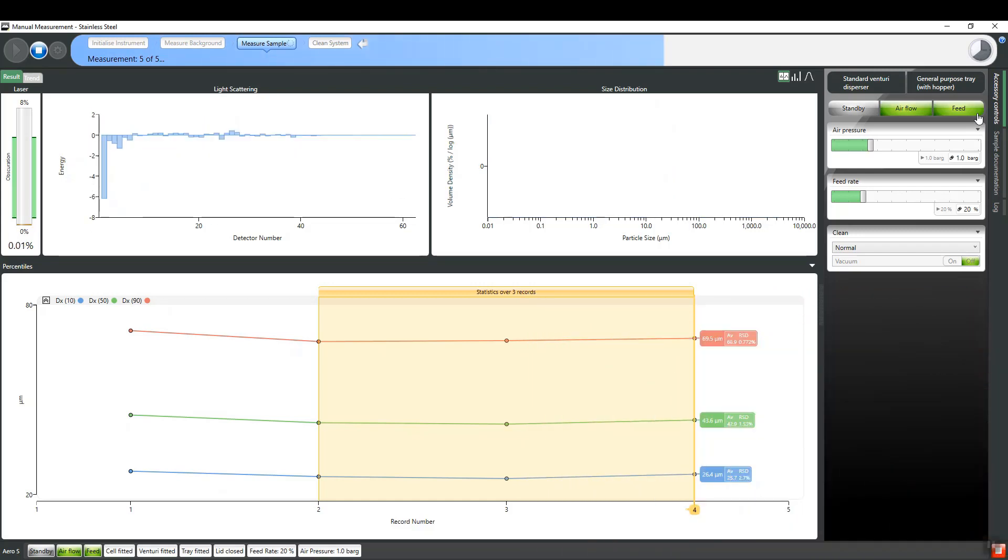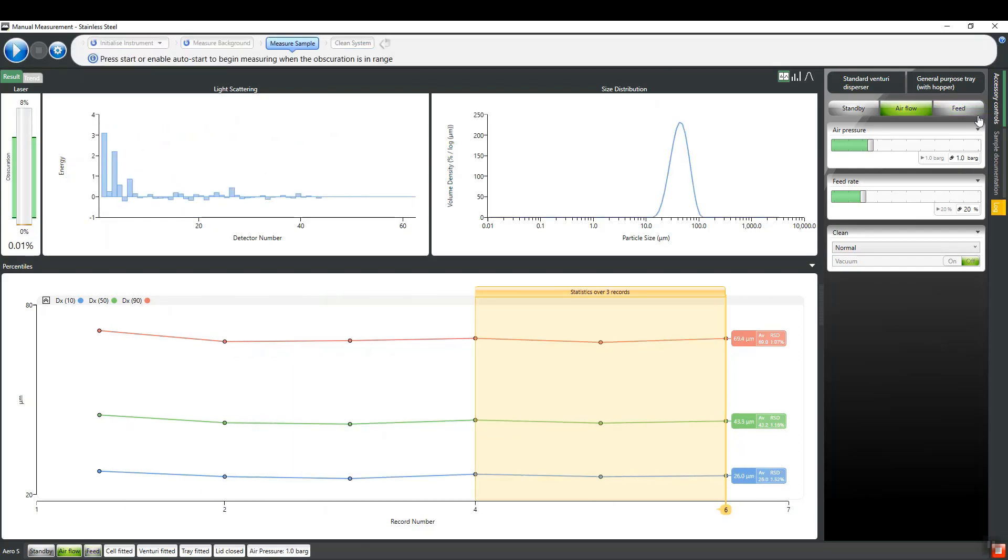Results from individual measurements will be visible side by side each other on the trend graph at the bottom, which shows the sizes of the DV10, DV50 and DV90 percentiles.